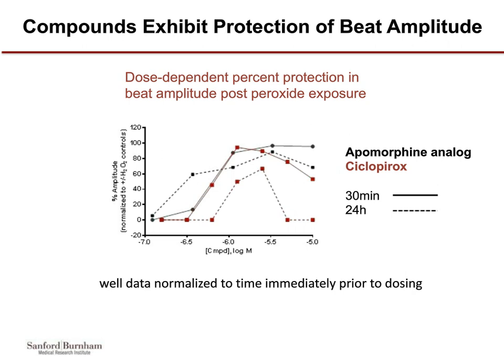That's what's nice about using this instrument, is that you can both look at response and you can look at cytotoxicity of the compound. And so once we have some candidate compounds from our screen, we'll be able to put them in this experiment and look more at their mechanism in terms of the beating rate and rhythm of the cardiomyocyte.